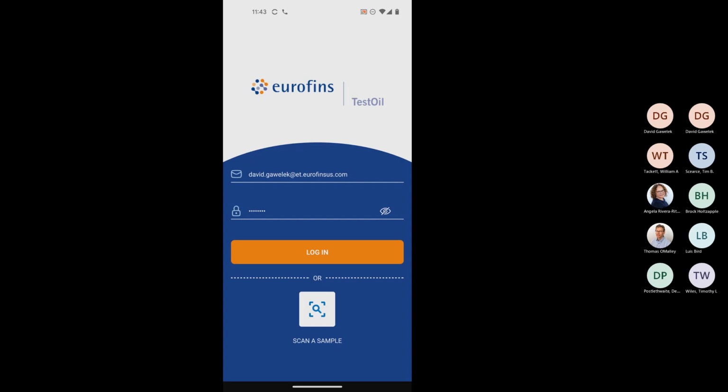Yes. So I think the spirit of the question is, can you manage user access by asset?